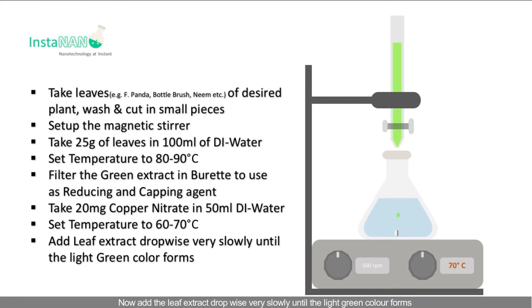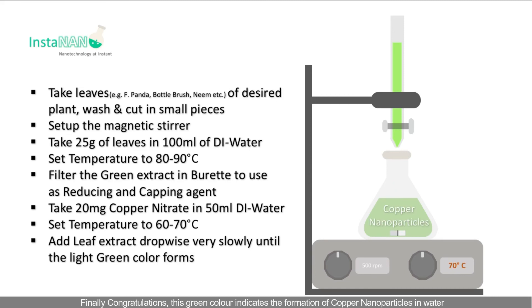Continue adding the leaf extract until a light green color forms, then stop. After the color changes to green, congratulations — this green color indicates the formation of copper nanoparticles in water.